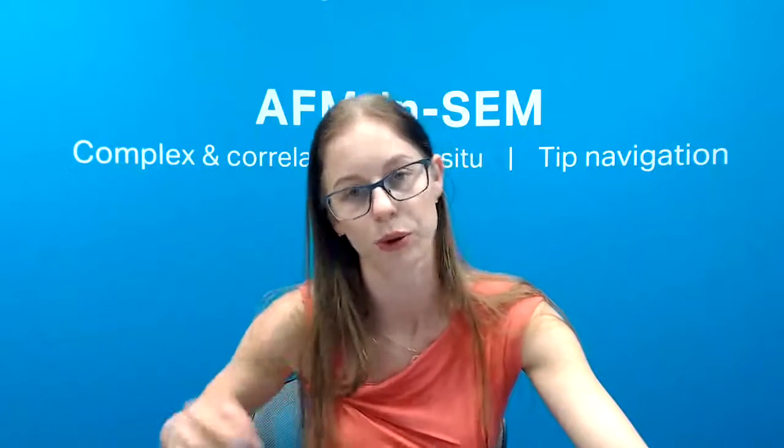And the third question which we have, which I'd like to answer aloud, is can we somehow access raw data after using fit and leveling functions? Actually, even though we use the fit, it's not saved in the raw data. The raw data are never lost. We don't want to change them, because if we make the wrong correction, we want to get back to the raw data. So don't worry, we have the raw data saved in the software in the file.